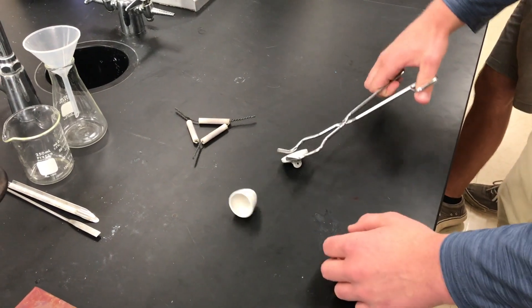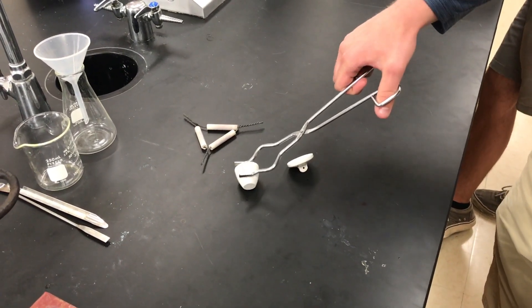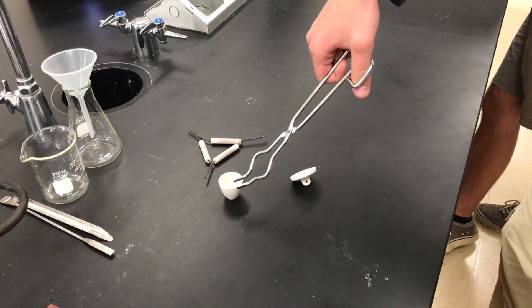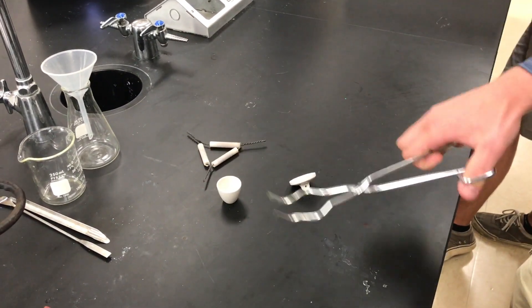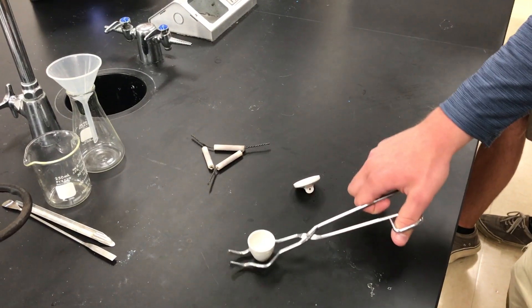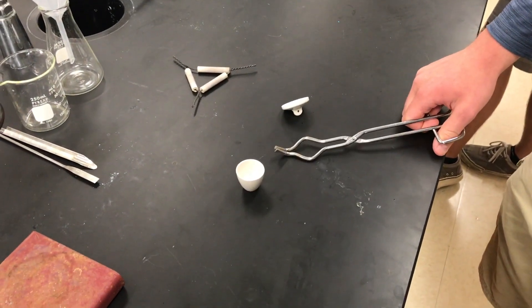It has a cap on it and it is used to cover the material while it is under or over the flame. You put materials in it and you mix them up with other materials to heat them up for your experiments. They range from $15 to $20.